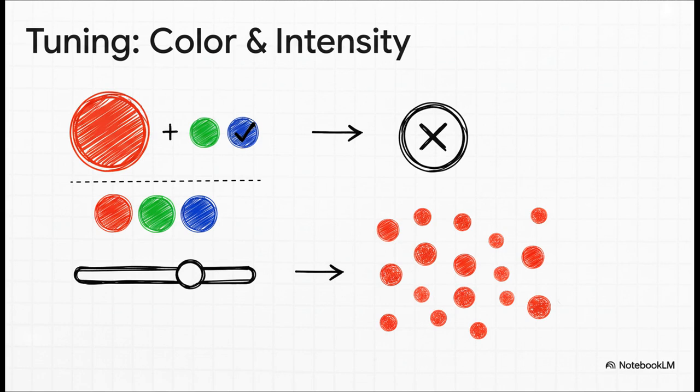Well, first up is color. You set the red dominance ratio to tell the software, hey, I don't want just bright spots, I need spots that are overwhelmingly red. Then you set a minimum red intensity, which is like saying, and while you're at it, ignore any of that faint, fuzzy background noise that isn't a real particle.